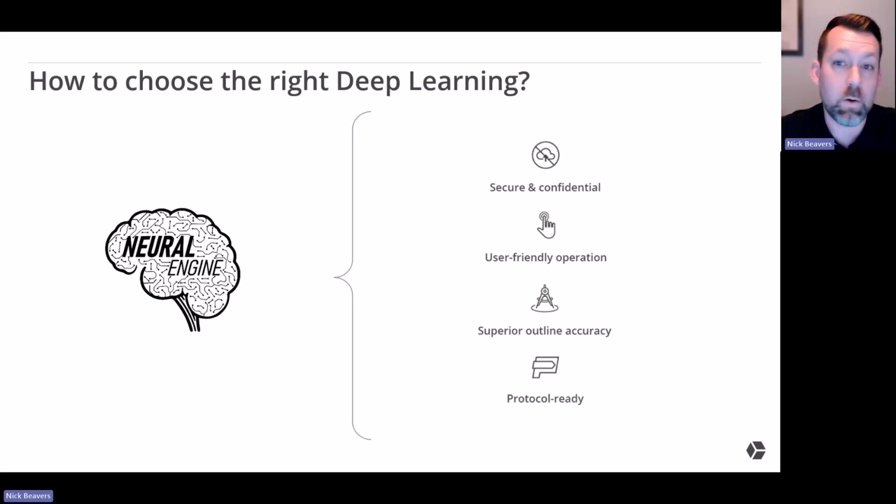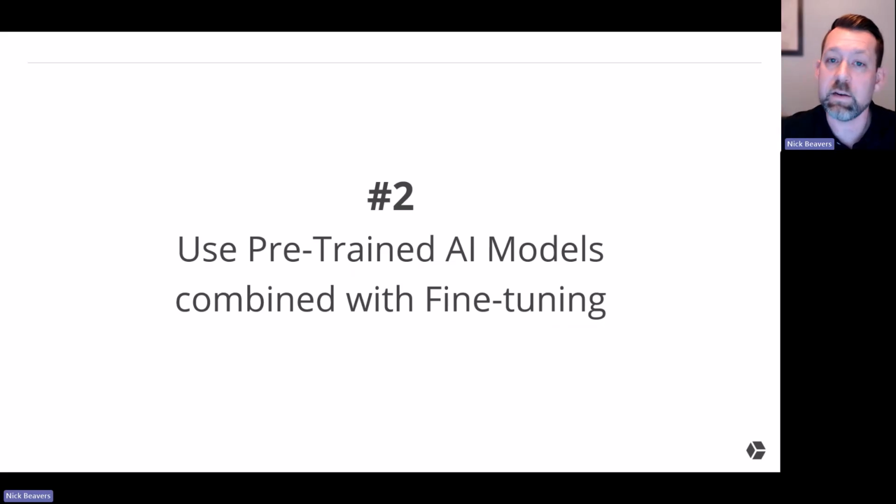Again, if you don't want to use ImagePro, I'd highly recommend you check those out. A number of them are available in a lot of different packages. Not many packages are including all of them in one. That's kind of one big unique thing about ImagePro, but they're definitely out there for you to use.